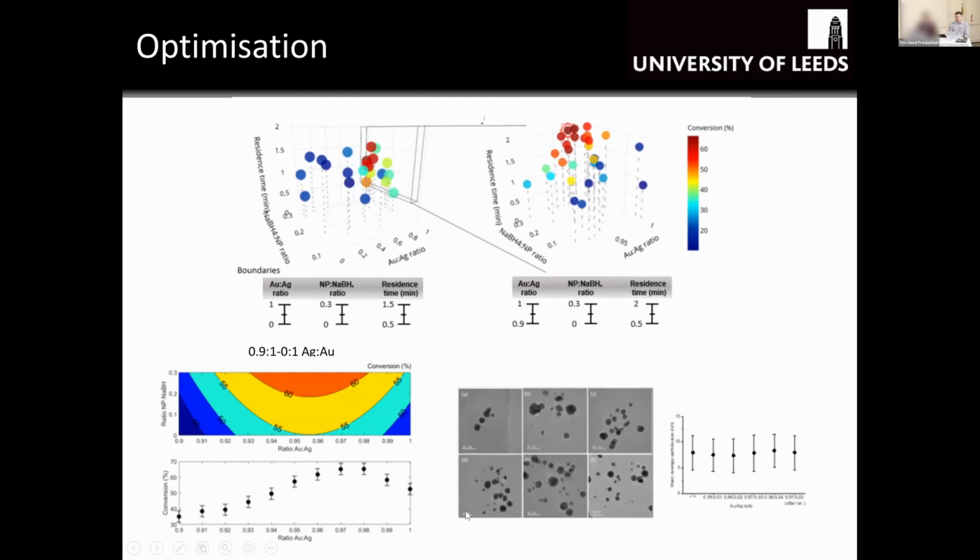We captured all these materials to check that the nanoparticle size was the same in all of them, and you can see it pretty much is. So the nanoparticle size is consistent, but the catalysis favours this 97 to 98% gold.